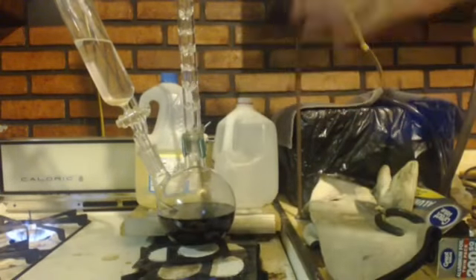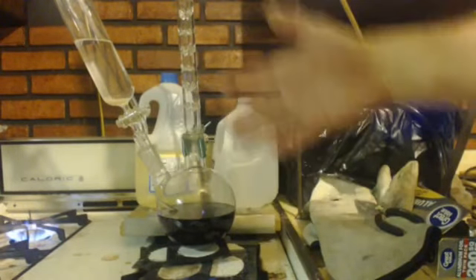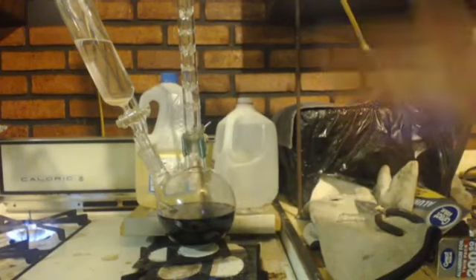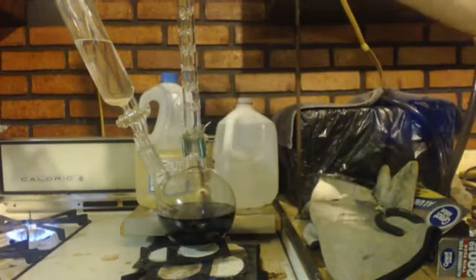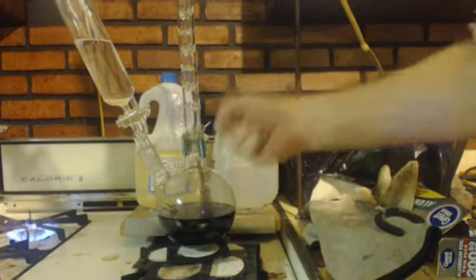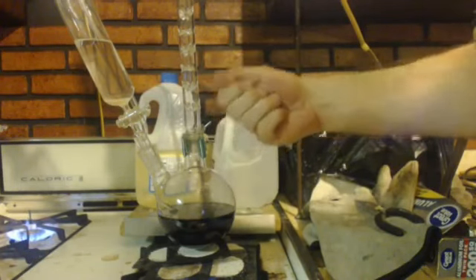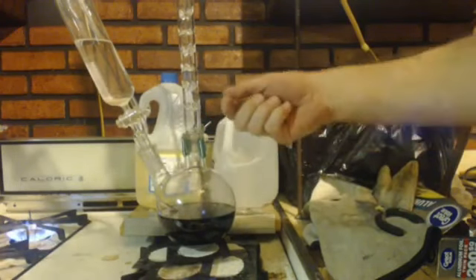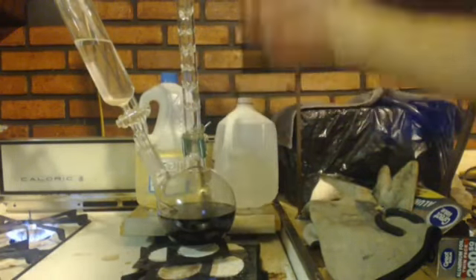Okay, this isn't the apparatus, but I wanted to say something that's in the video there. That's the equalizing funnel that had the ethyl bromide in it and the diethyl ether. I was going to drip it into the magnesium metal, but I also should have had diethyl ether in there. I didn't put it in there, though, because I was cheap. But anyways, I already did that.